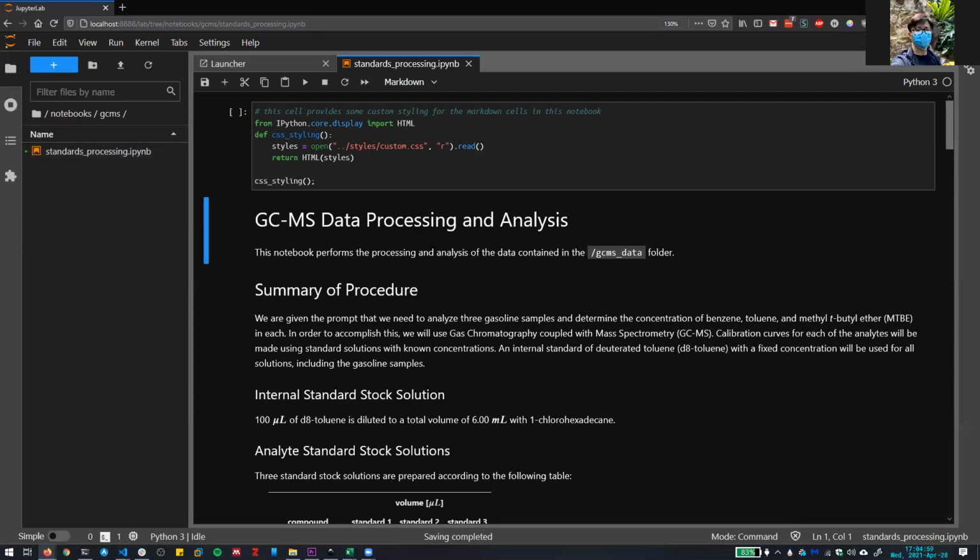No, you have to download it from GitHub. The link I posted in the chat, just re-download the .zip folder and then extract it somewhere. Then you basically just need to navigate to that folder with your Conda environment activated so that you have access to all the libraries that we installed on Monday.